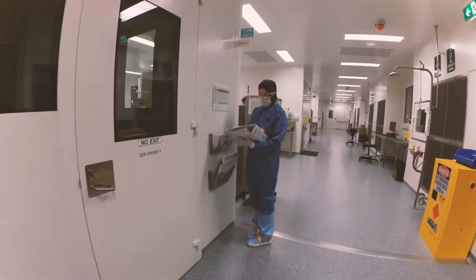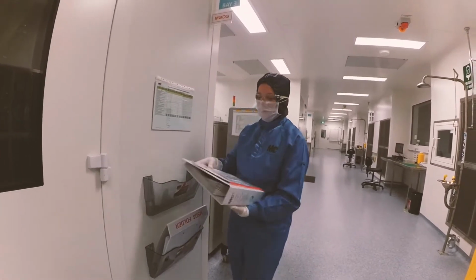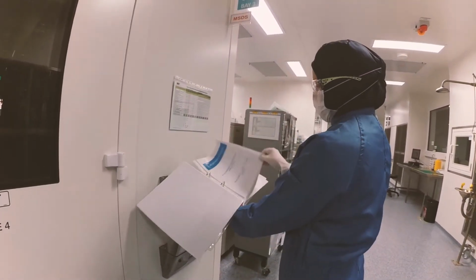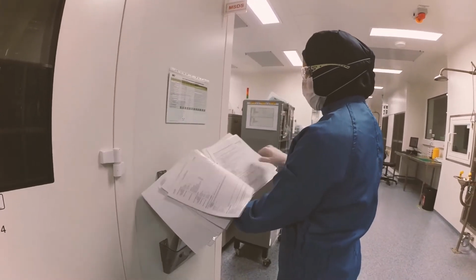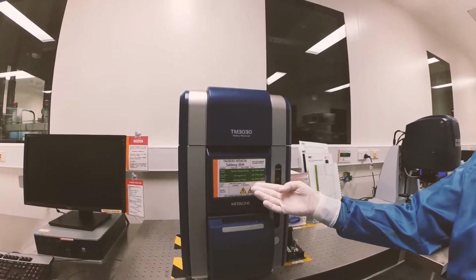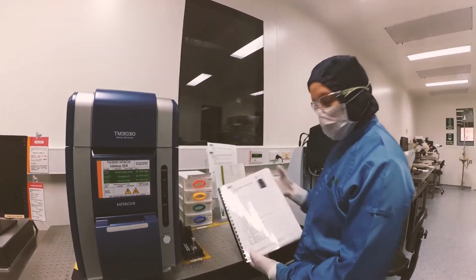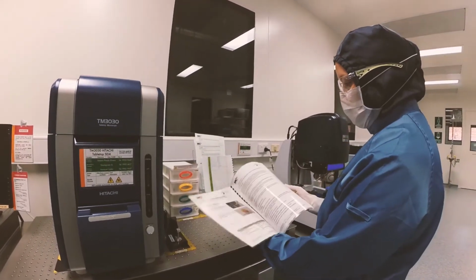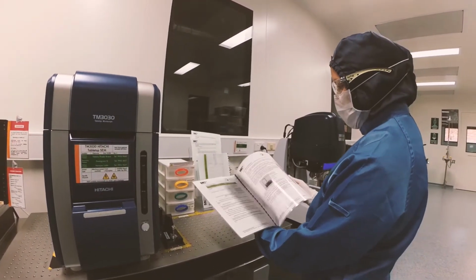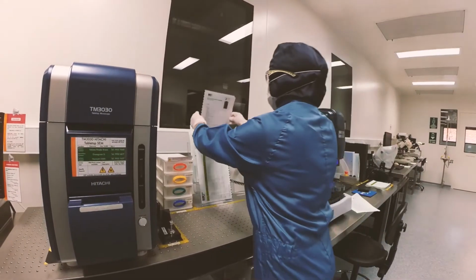Material safety data sheets can be found at the end of each bay. MSDSs contain critical information about the chemicals that are used in each bay. Every tool or process present at MCN comes with a Standard Operating Procedure document, or SOP for short. The SOP consists of the detailed safe working instructions for the corresponding machine or process. At the front of each SOP is a risk assessment for the task at hand.